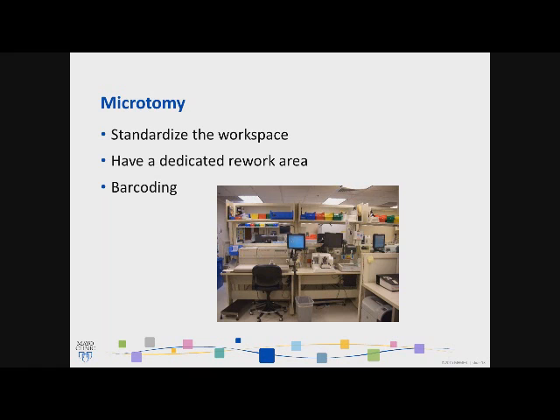And what is a rework area, you may say? So, for instance, all the blocks are faced, and they're soaking, and they're waiting to be cut. Once you cut a block, if for some reason the tissue chunked out, if it is dry, if any type of issue occurs, you then set that block off to the side to soak longer, to have surface decal, anything else like that, that then needs to be set in a certain area for rework.